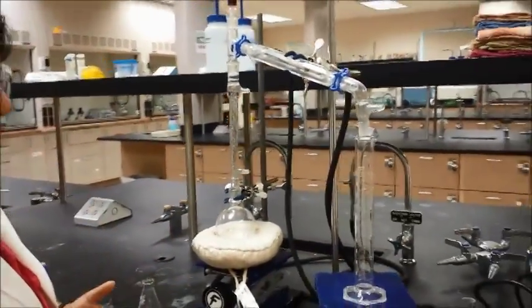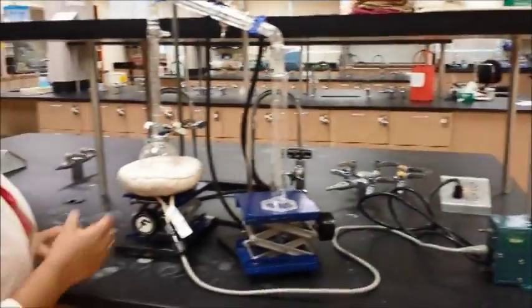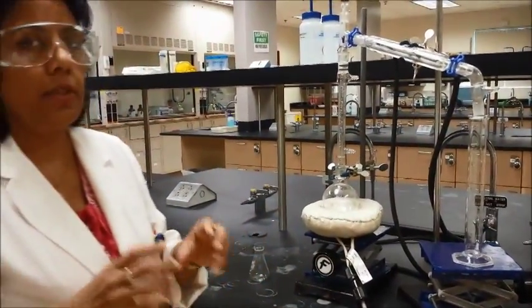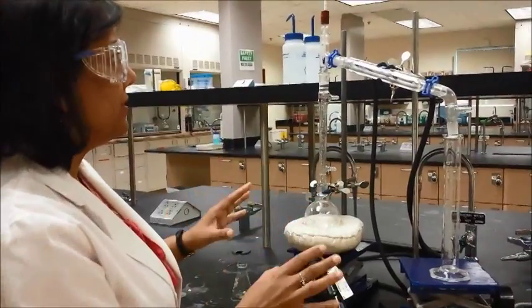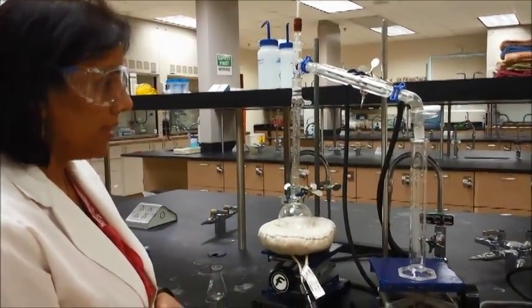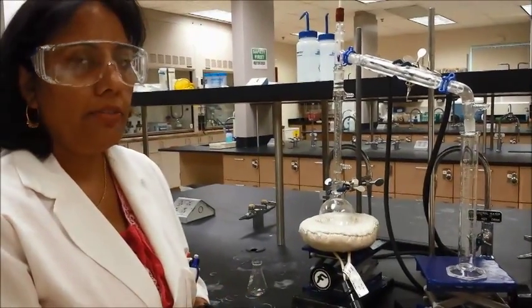For the fractional distillation you still have the same rheostat and heating mantle — everything else is the same. Your heating rate is going to be very slow because you want to do fractional distillation at a very slow pace. You still need boiling chips inside the flask. That's how you would set up for fractional distillation.